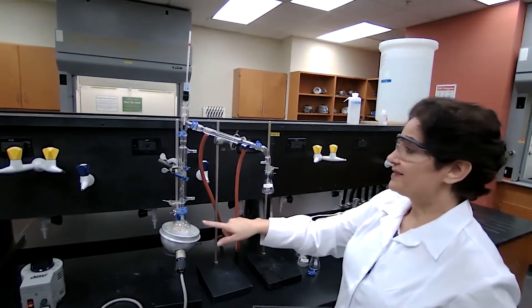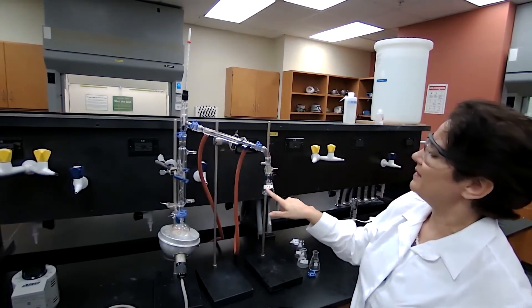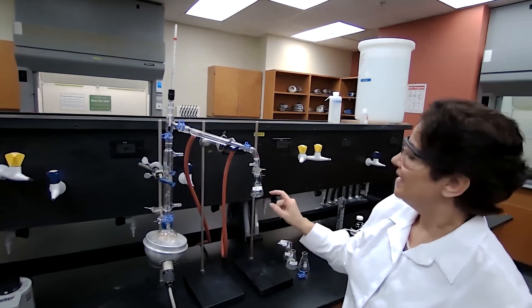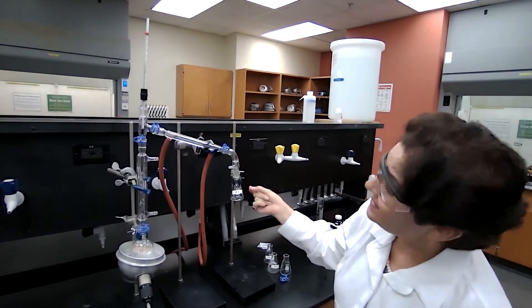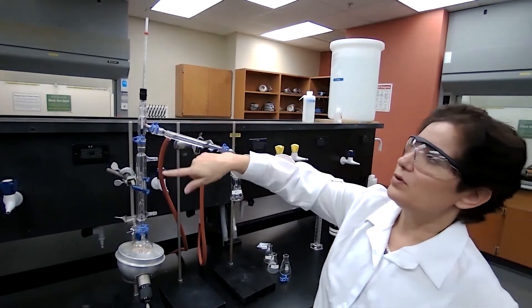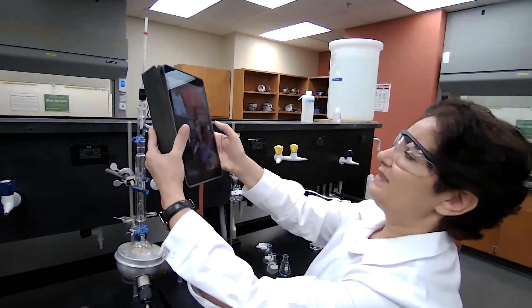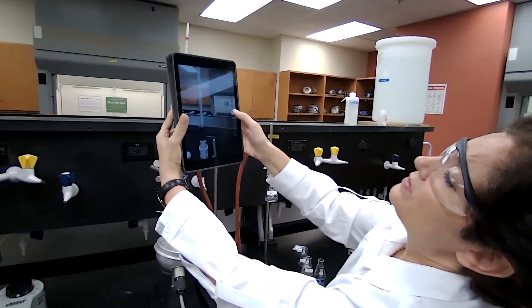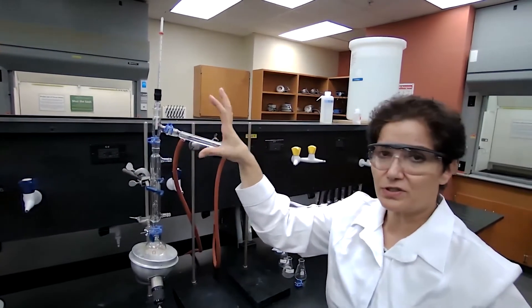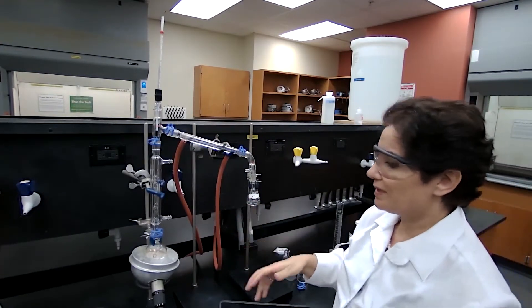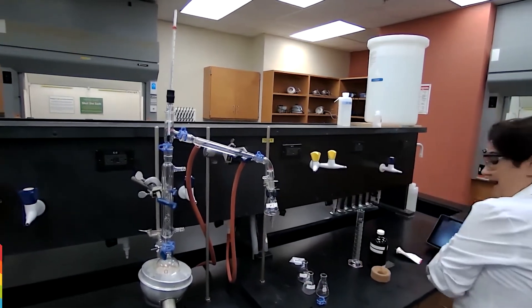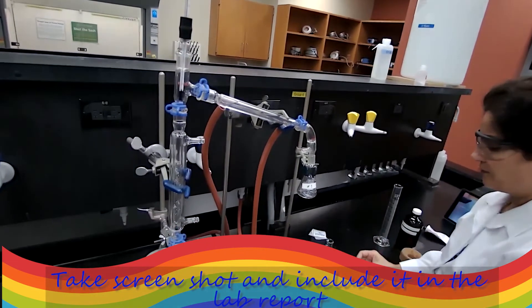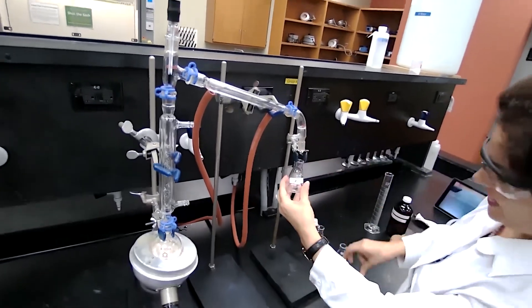Okay. The first distillate is being received now in the fraction one flask. And after the six drops, I'm recording the temperature for the first distillate. I'm taking a still shot to include that in the video so you could actually focus and see the temperature. After the first six drops, I'm going to switch the flask fraction one with fraction two.